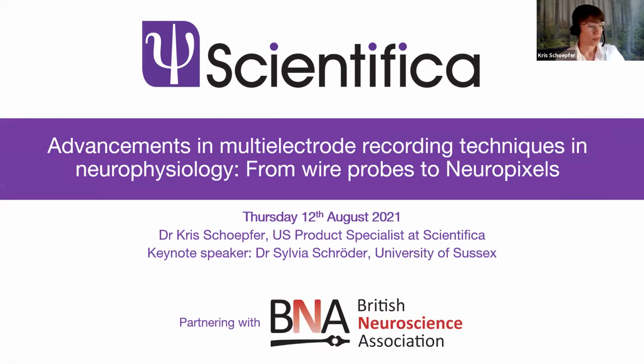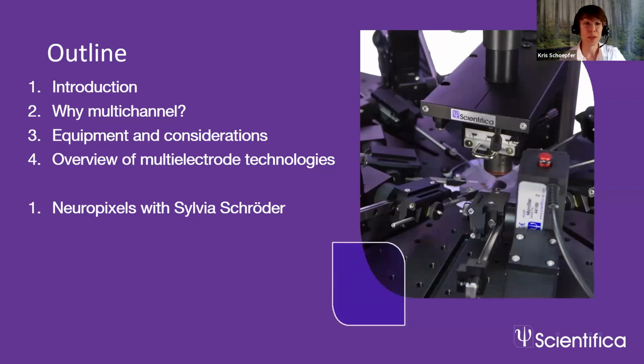All right, so thank you again for that introduction. Today we're going to be chatting quite a bit about in vivo electrophysiology and multi-electrode recording techniques. Here's a brief outline of our talk today. I'll start with a very brief introduction of extracellular recordings, discuss some benefits on why people may want to research with multi-channel electrode recording techniques.